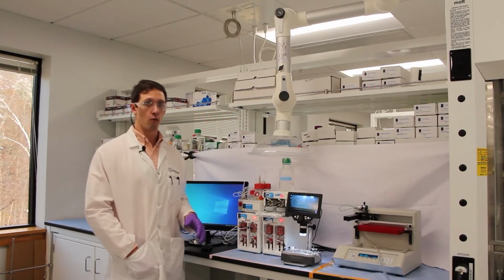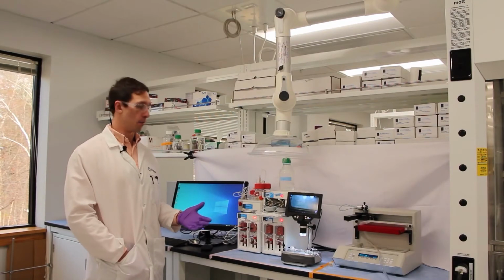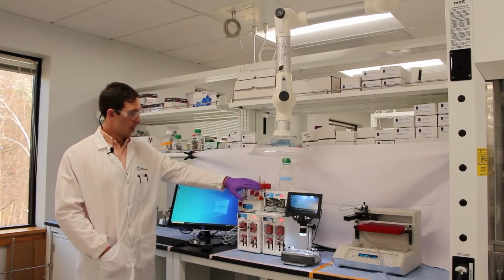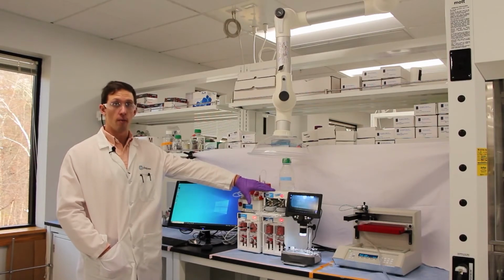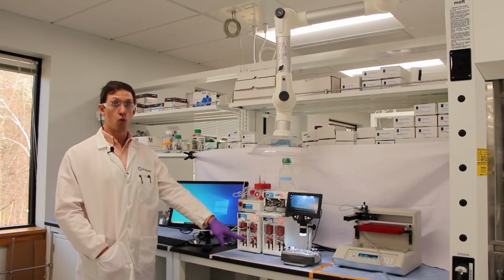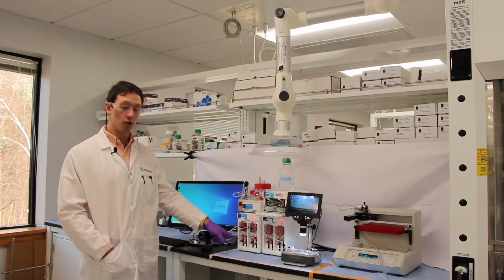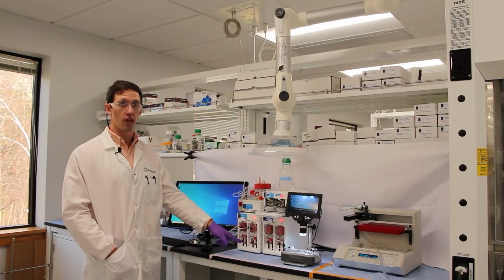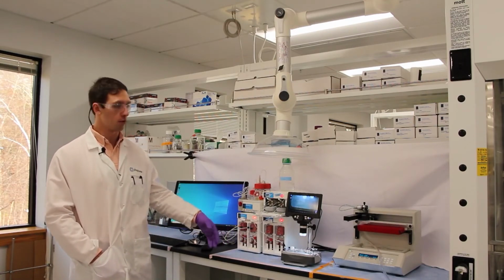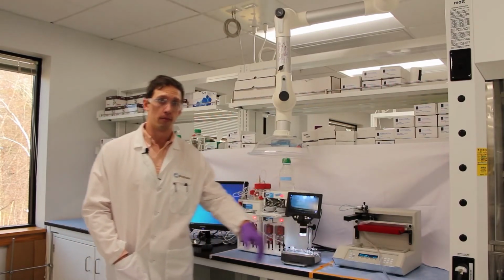Before jumping into the software, let's take a look at the different modules that compose the Dolomite ANPS. We have our pressurized input storage rack. We have our Mitos automated sample valve. These lower two modules are our two quad pumps. Note that each quad pump has two pairs of syringes. Each pair of syringes represents a separate pump. So between the two modules, we have a total of four pumps. And then lastly, we have our Gilson automated collector.